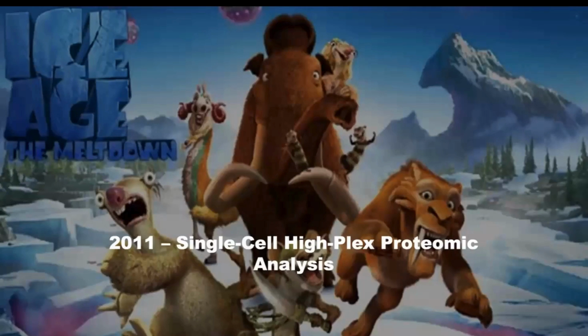So when I moved to Yale in 2010, around that time was another interesting inflection point in the whole history of single cell biology. You were able to look at dozens of proteins and realize high-plex protein measurement, including the technology I just discussed, but other technology came out around that time, such as CyTOF. You can use metal labels to look at dozens of surface markers to better phenotype, or better immunotype, different cells in an extremely heterogeneous population. So I love my device.